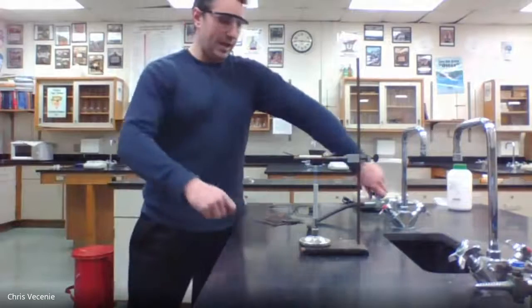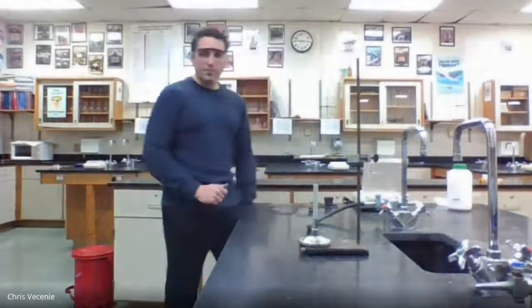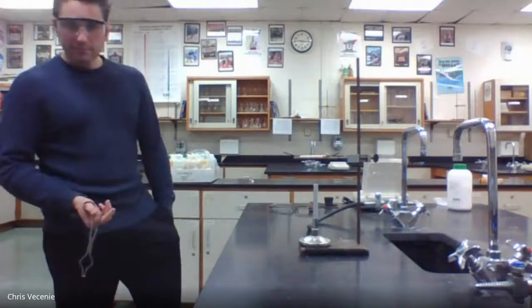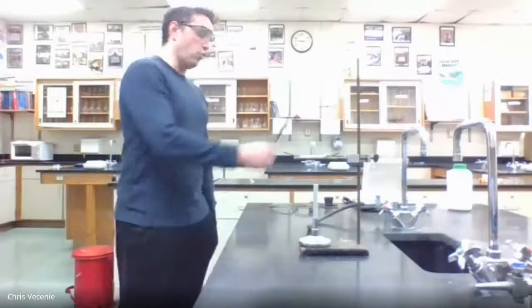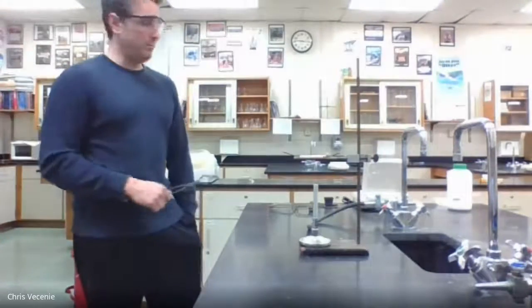So if I would go back, bring my wire gauze up, move this guy over again. Gotta let it cool just half a beat. And then hopefully when I put that guy up on there, it's gonna say 2620. And when it does, that means we're done. If it says 2618, there's still oxygen leaving. We go back up: heat, cool, put it on. If it says 2621, we're actually done as well. It means that water has started attaching from the air, which means if it starts to get heavier again, you're done as well.